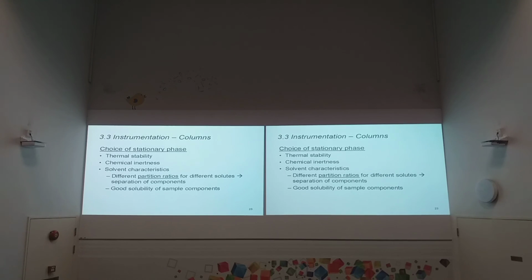This one we discussed previously. Now you travel very slowly in the column. Another interaction, we have a very minimal interaction. You come in, then you go away. How? Because the mobile phase is constantly flowing through the column. So the mobile phase will push you through the column. So two different types. All this is related to the chemical property of the stationary phase, the chemical we use, and then the chemical property of the molecule, let's say your caffeine or your Panadol, right?